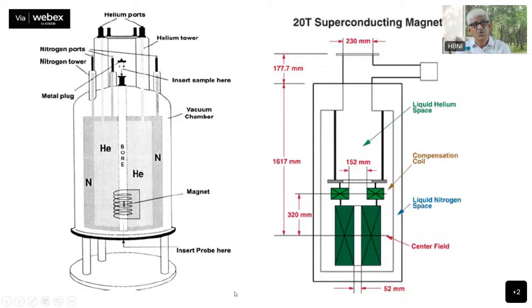After that is done, what you are providing in the shim system is external to this magnet system. And you have these coils outside there. Okay, so these are the general dimensions, and typically this axial magnetic field goes up to a couple of meters. There is an axial magnetic field which will go up to the 5 Gauss line and things like that. We have this outside the magnets.